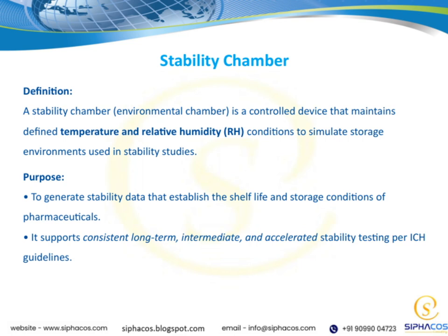Now, why is this important? Well, the purpose of these chambers is to generate stability data. This data helps us determine the shelf life of a product and the best storage conditions to ensure its quality over time. Essentially, they help us predict how a drug will perform throughout its intended lifespan.